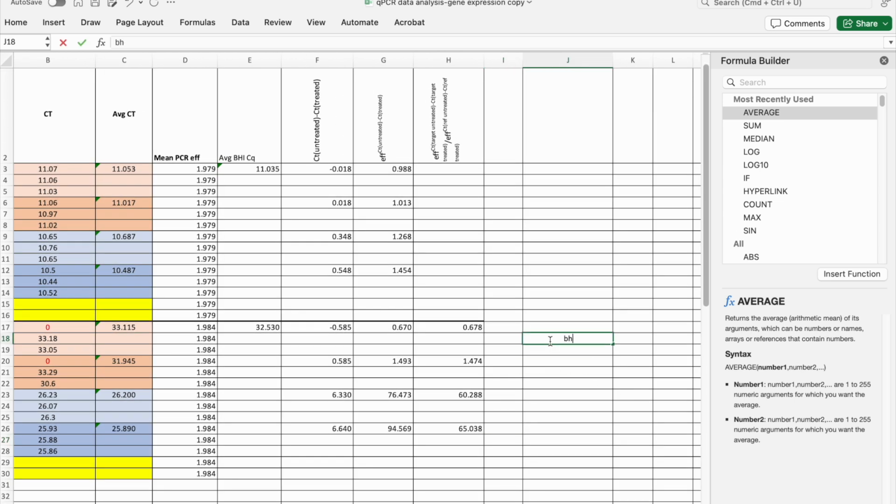You just have to write BHI1, BHI2, plot 1, plot 2, and enter the data 0.7, 1.5, 60.3, and 65.